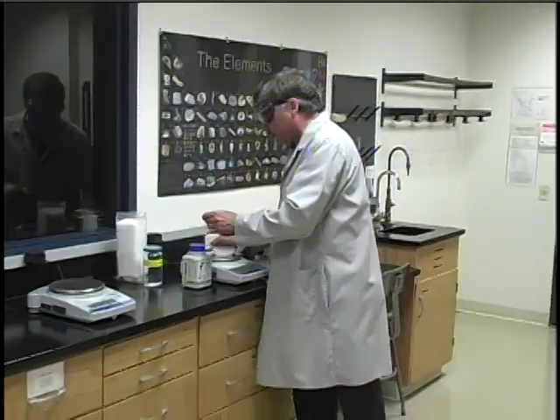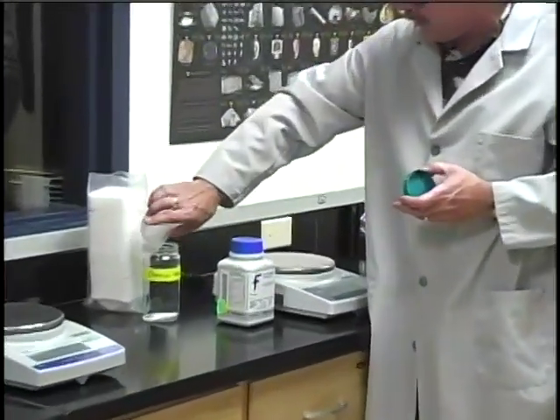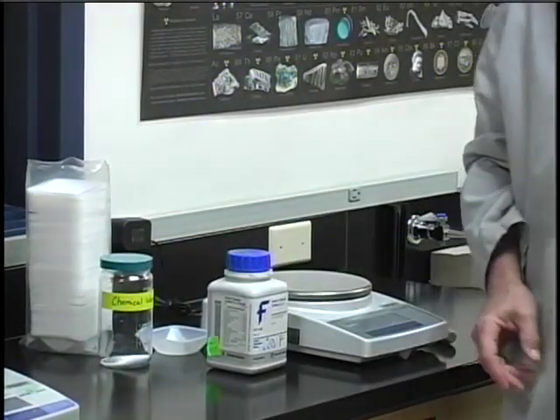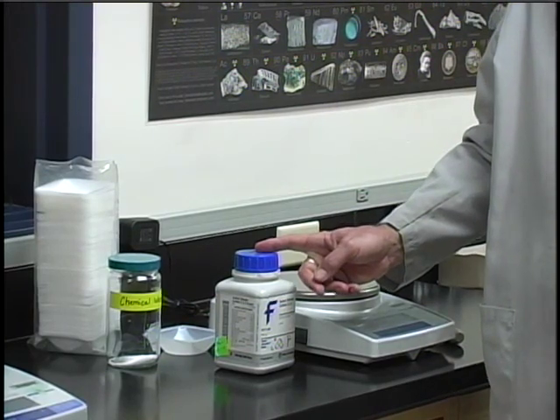If you can't find another student who needs that chemical, then your only other option is to dispose of that chemical properly. There is no option to put it back in the reagent bottle — that way the reagent bottles don't get accidentally contaminated.